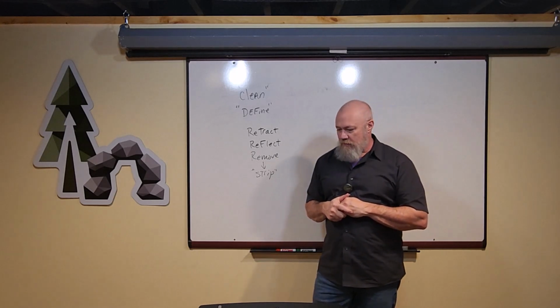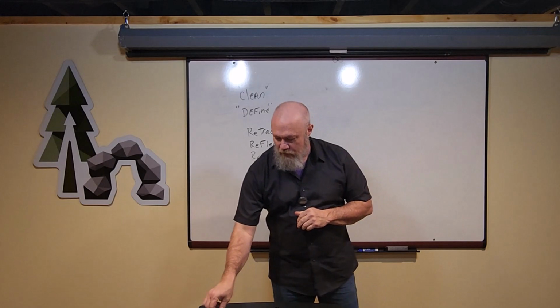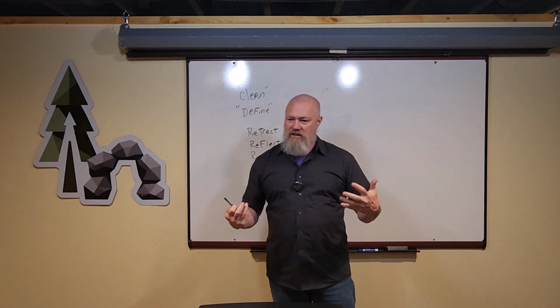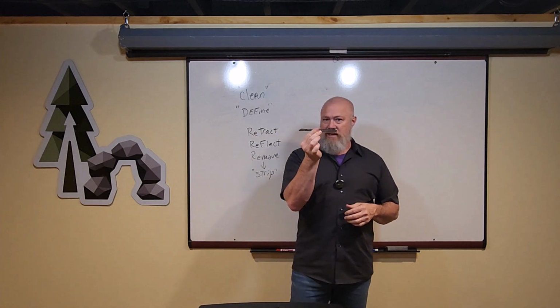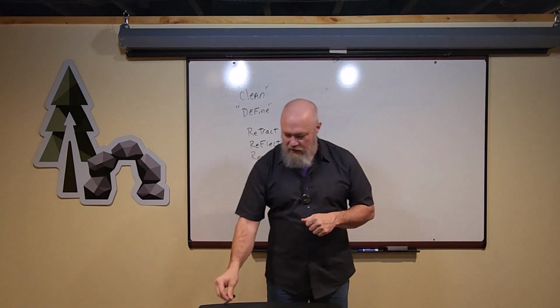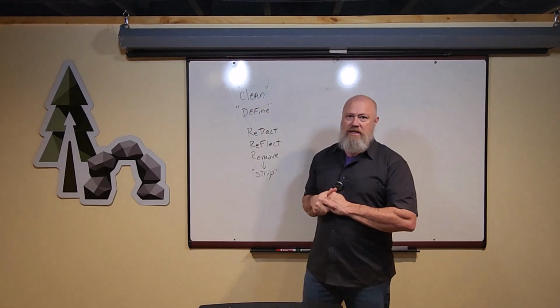But I want to emphasize once again that in my class we're going to use the scalpel for sharp dissection for the skin. Once the skin's removed, we're going to put this away, except in very few circumstances. It's very tempting to get in there and cut through things, but you're going to cut through tissue and structures that you're going to need later.